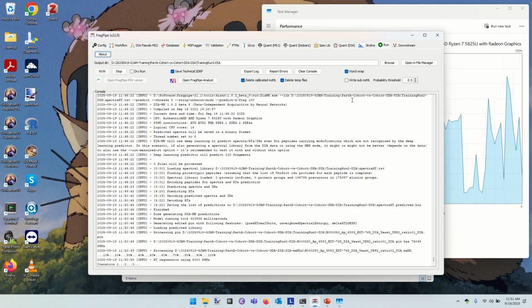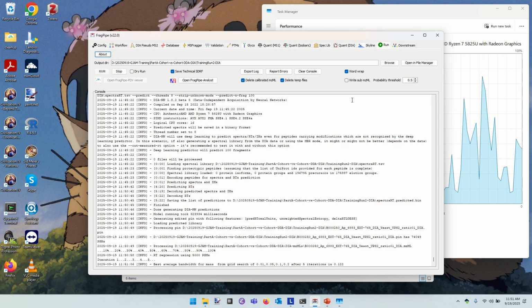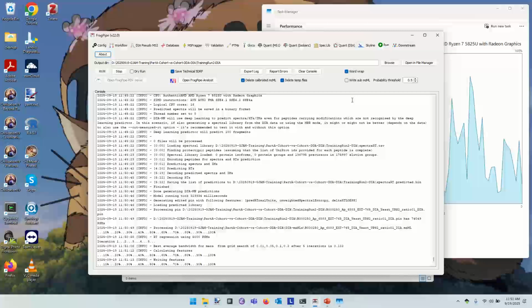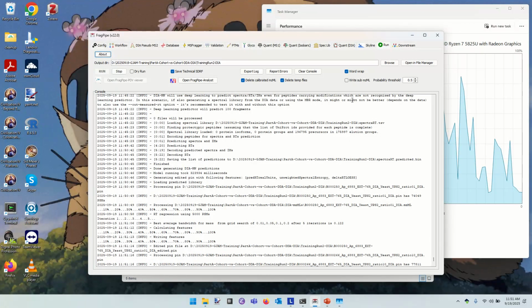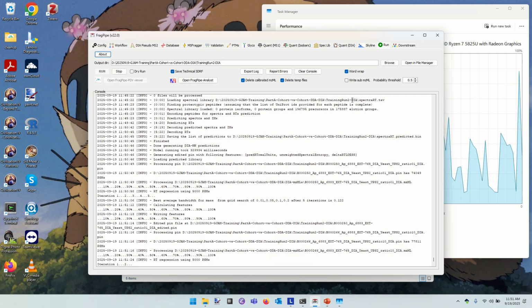Ultimately, when you're making your comparison of whether this protein is or is not differential between these two cohorts, you would like that list of proteins to be relatively compact. You don't want a whole bunch of stuffing in there of peptides and proteins that don't really exist. So the software is being careful about building this inventory, and the inventory will then get shoved into a spectral library.